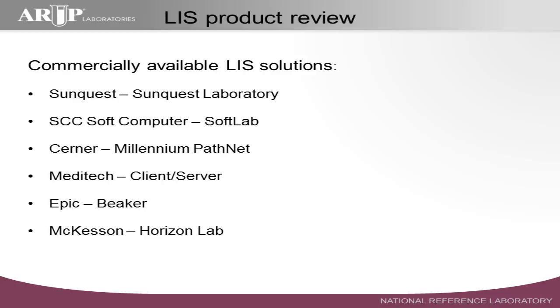Sunquest and Soft, been around for a long time, very popular systems, very solid systems. The three up there that are part of a bigger information system or clinical suite of information system products would be Cerner, Meditech, and Epic. So you can buy an EMR from them and many other clinical information systems, including Lab. But they're also all sold standalone too.